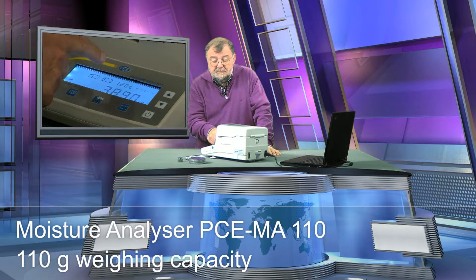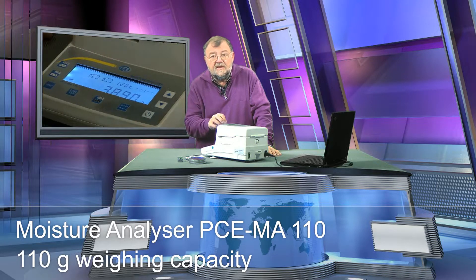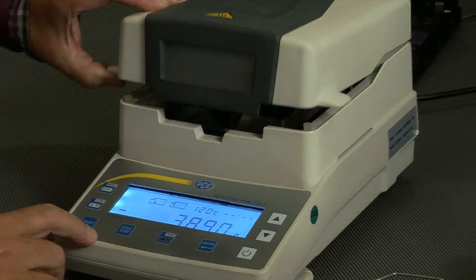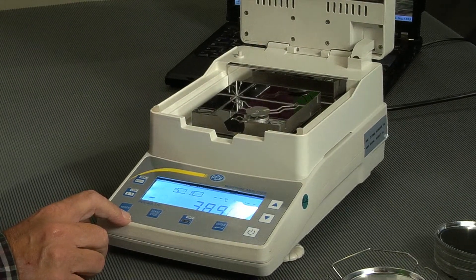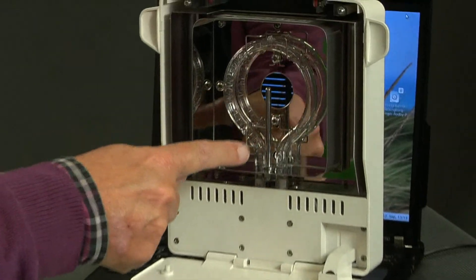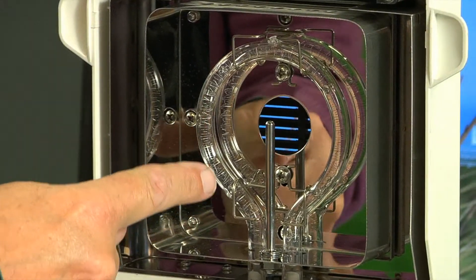So here I have from PCE the MA110. That is a device which is very tricky. Watch out, I'll show you. When I open it, we have the top in the lid — a circular lighting.